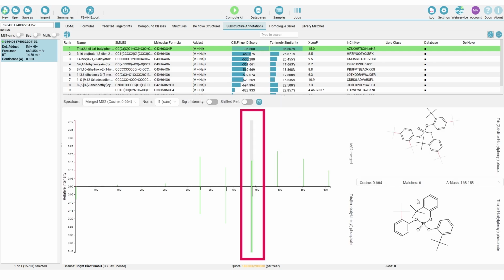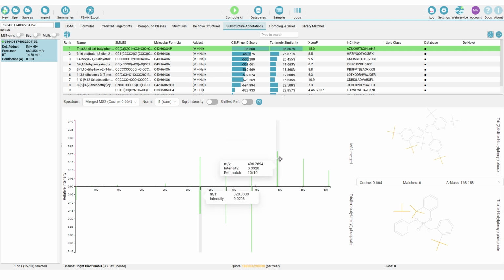Selecting a peak will automatically highlight the corresponding peak in the matched spectrum that was determined during cosine matching. If the current library match we are inspecting is an analog match, some peak matches will represent shared losses instead of shared fragments. The corresponding losses substructure is highlighted in yellow instead.